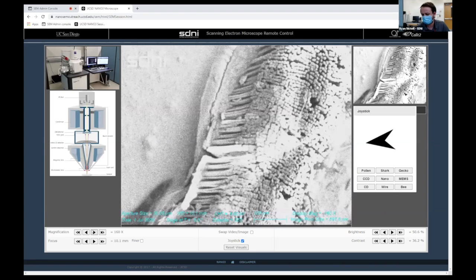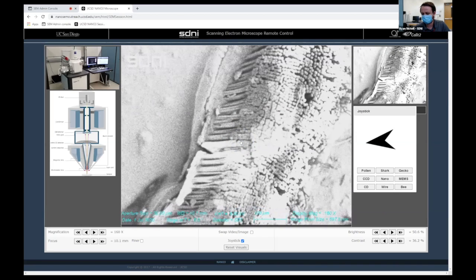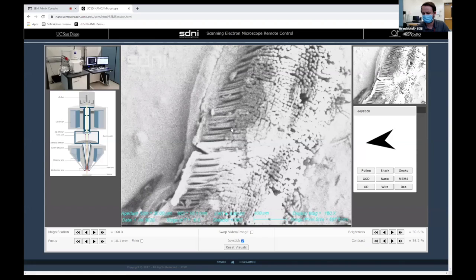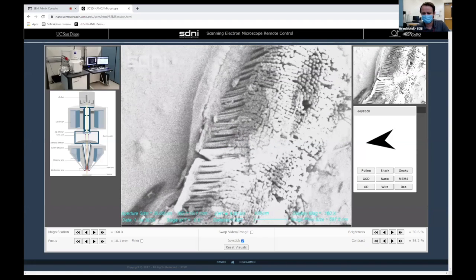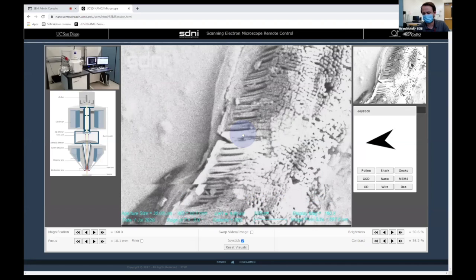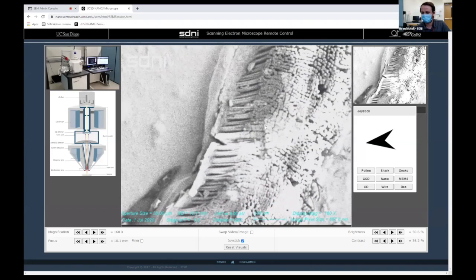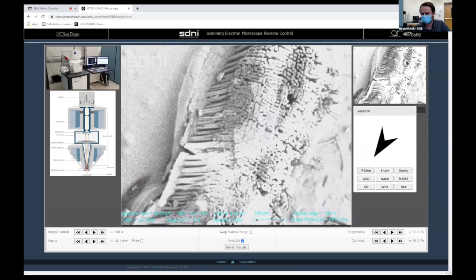They're not hairs. They're called setae. And this is what allows a gecko to have its stickiness. So keep zooming in a little bit more. What we'll find is that these hairs break off into many, many, many smaller hairs. A human hair is about 50 to 100 microns in width. These hairs are about 10 times smaller, and they break down into 100 nanometer size filaments, as we'll see in a moment. So click the right magnification button again to zoom in even more.